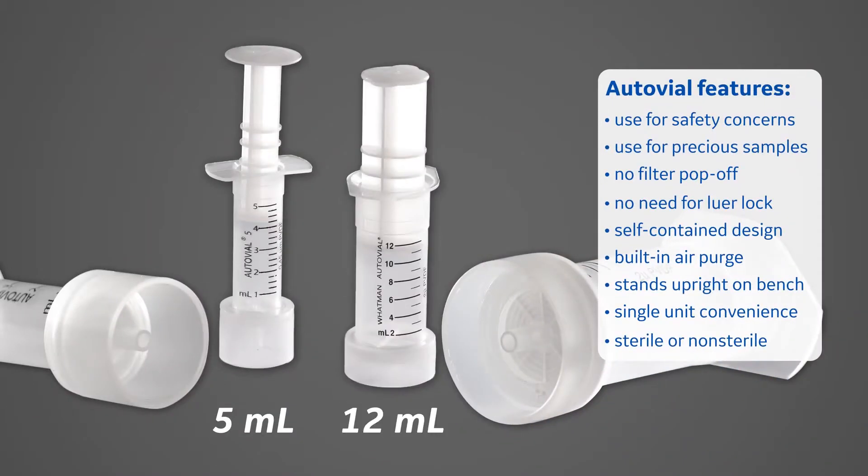Is safety important to you? Are you filtering hazardous or precious materials? Has your syringe filter ever popped off the syringe during a filtration? The autovial prevents that as well with its self-contained design.